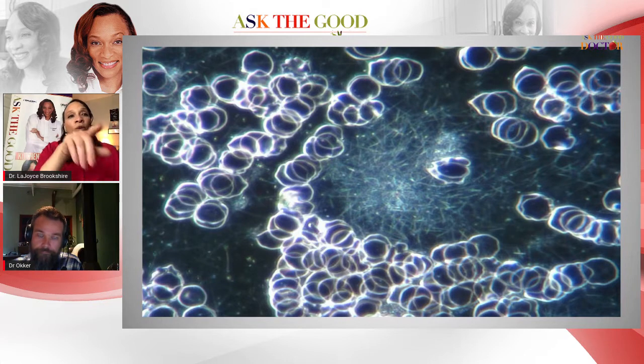And you can, with a great degree of certainty, determine that with a slide like this one, this person has been at it for a long time. Yeah, this wasn't one hamburger. Absolutely. So your day-to-day changes in diet and lifestyle won't really have a very noticeable and major impact on what you're seeing in the blood sample.